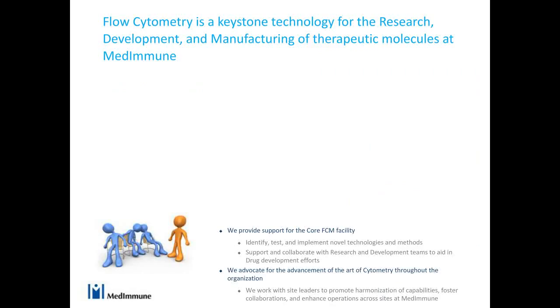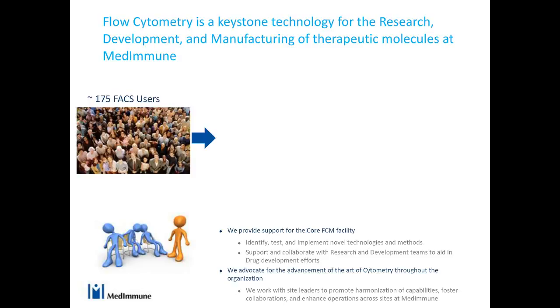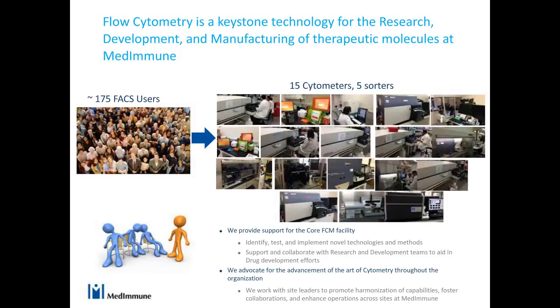As such, utilizing monoclonal antibodies as drugs, we believe that flow cytometry is a key tool for immunology and a keystone technology for our research, development, and manufacturing efforts at MedImmune. We have over 175 users at our site and over 15 cytometers and 5 cell sorters.